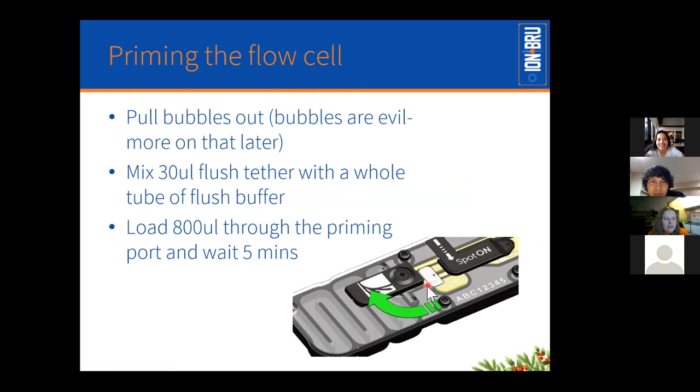So when you first get your flow cell, you see here we've got some kind of yellowy, greeny fluid in all of the channels at this end. You can see this is the port having swung the cover open, and you can see here there's no yellowy green just here, so that means that there's an air pocket just here, and you need to remove that before you try and put anything in through that port, so you don't push the bubble towards the pore array.